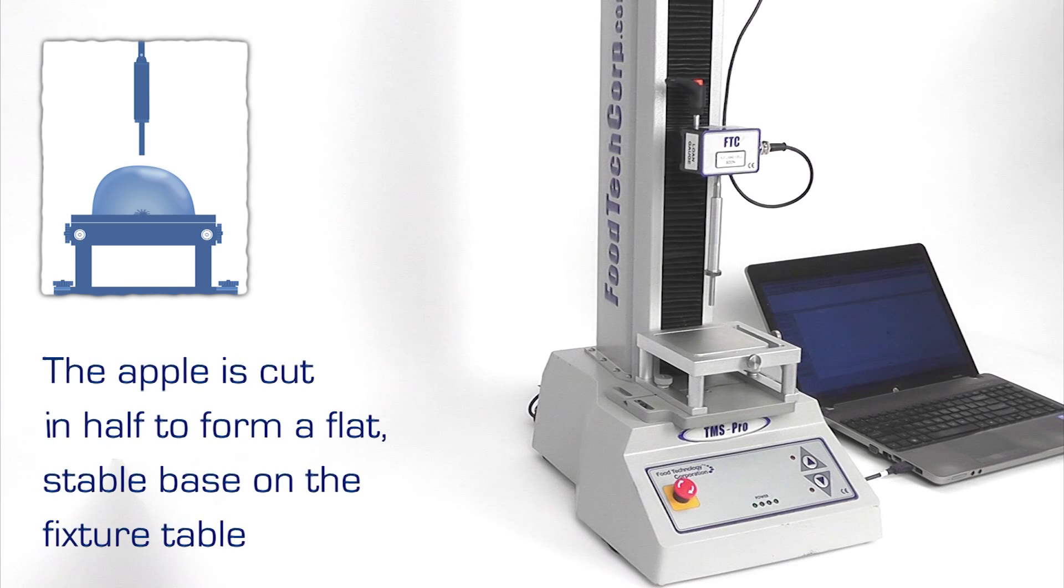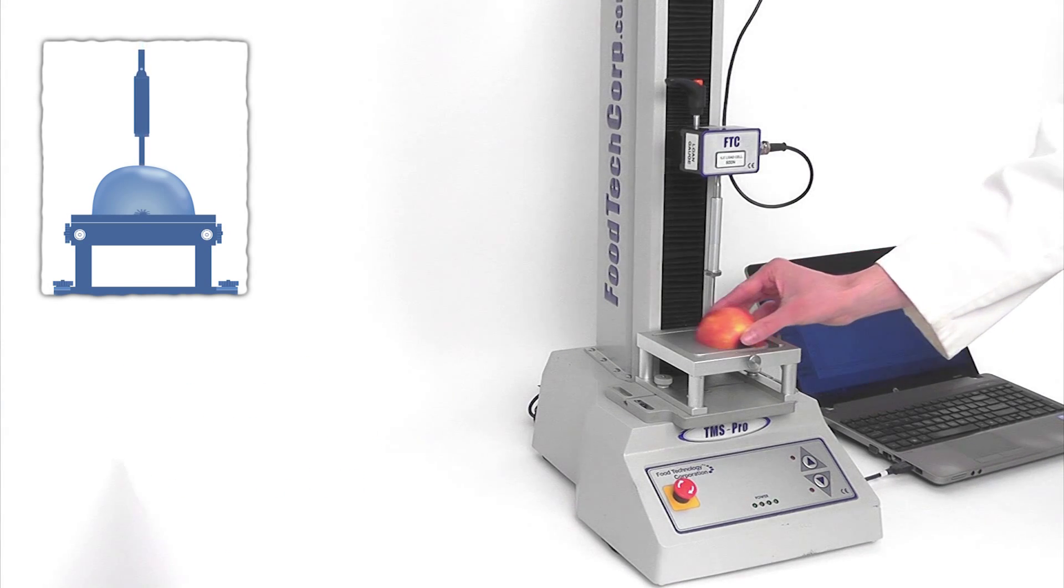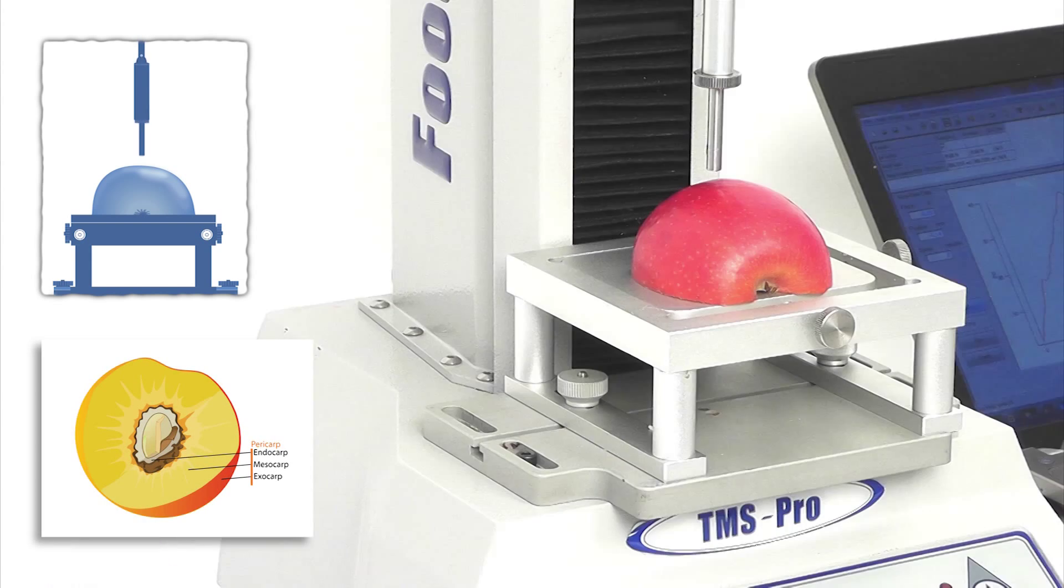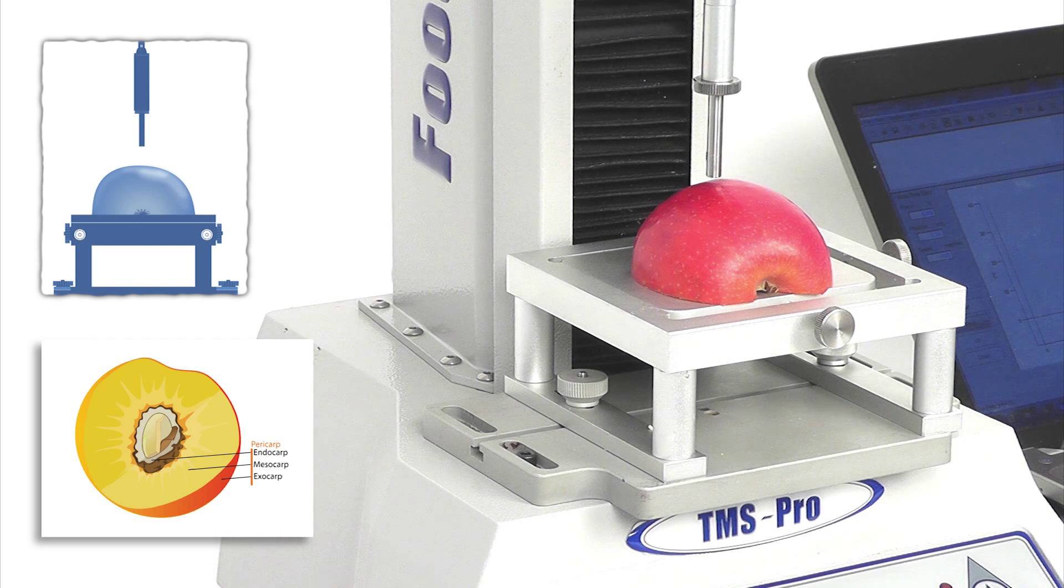The test procedure will lower the probe to detect a touch on the sample and zero the readings. The apple is then penetrated at constant speed. The skin may also be peeled at the point of contact to focus solely on the behavior of the interior flesh.